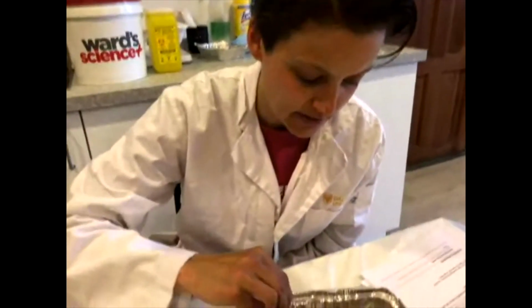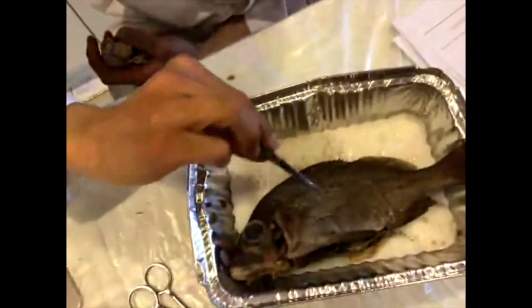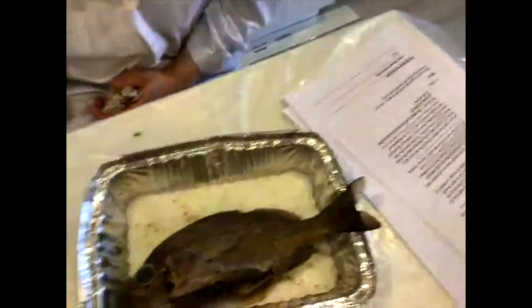Evan asked, is the dorsal fin the fin on the top? Yes, that is the dorsal fin. Yeah, we can go through the fins again. The pectoral fin is the one right here on the side, and then the pelvic fins are down here near the base. And we have a pelvis too. It's kind of like the area in between our hips. And then we've got the caudal fin or the tail fin in the back. I think that might be it.